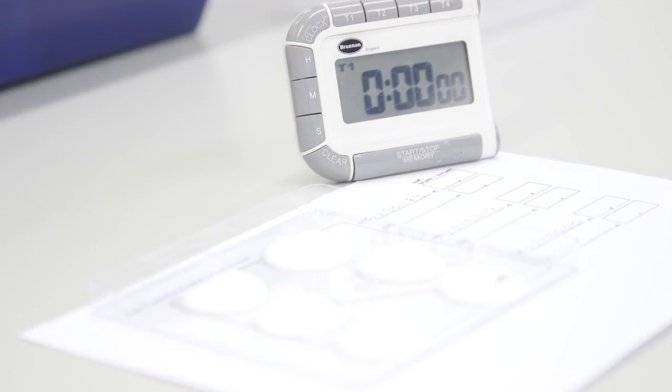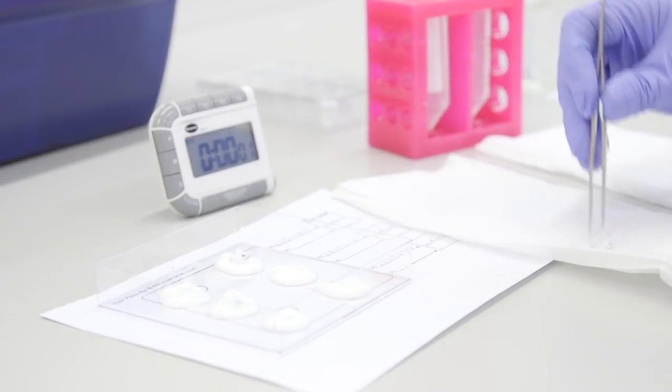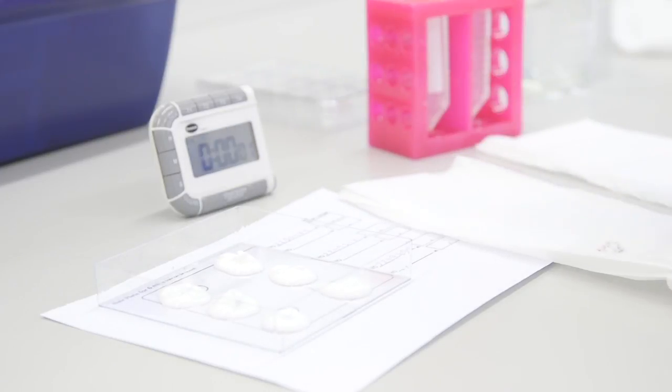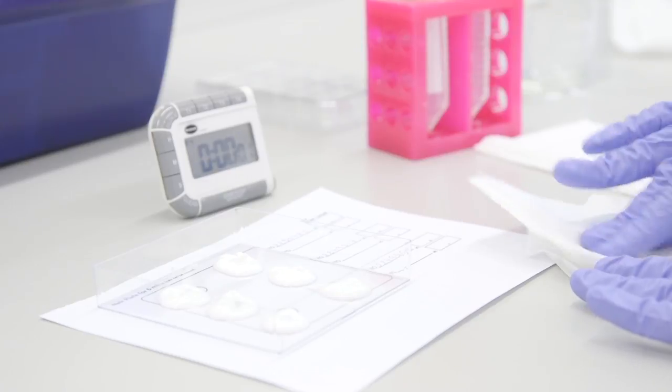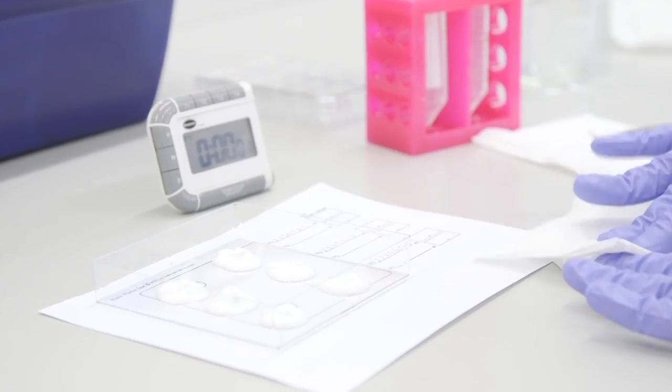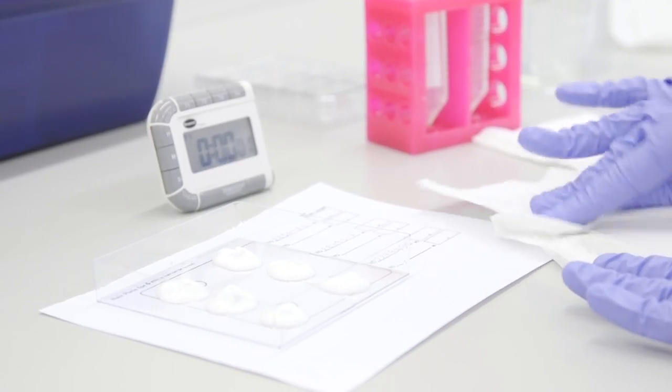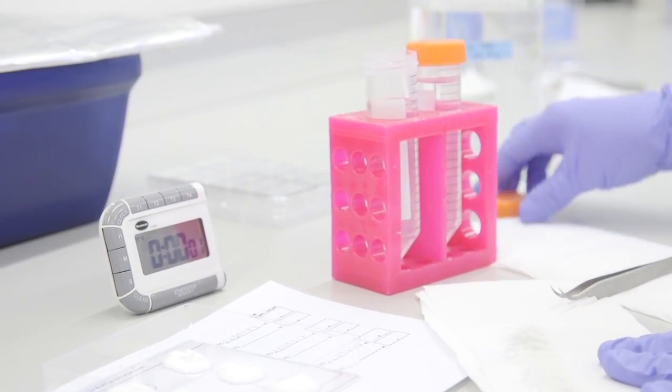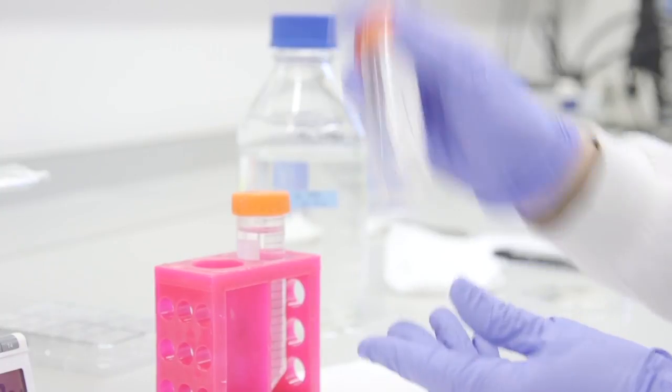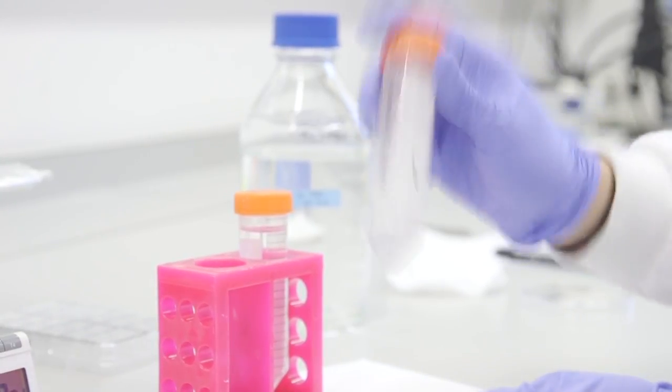When the 4 minutes are up, transfer the ears from the hair removal cream to a tissue. Using the tissue, gently rub the ear to remove the majority of the cream. Be careful not to squash the ear by rubbing too vigorously. Place the ears into a 50ml tube filled with PBS at pH 7.4 and shake to wash off any remaining cream.